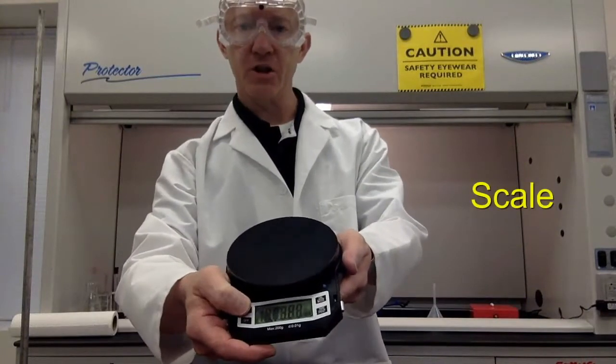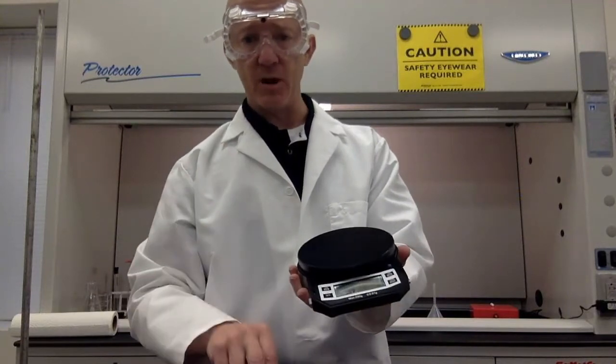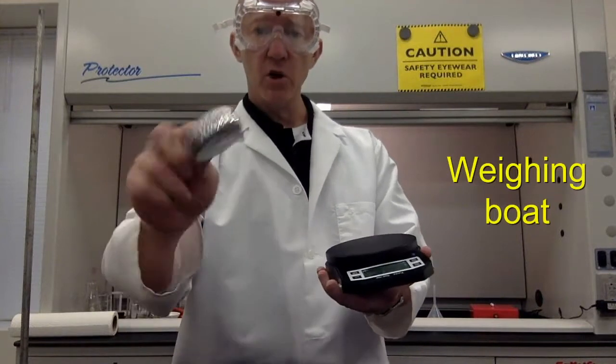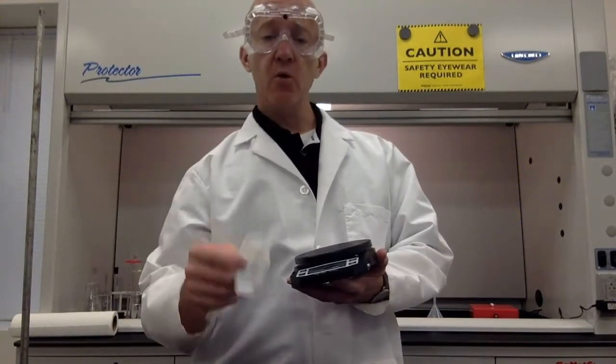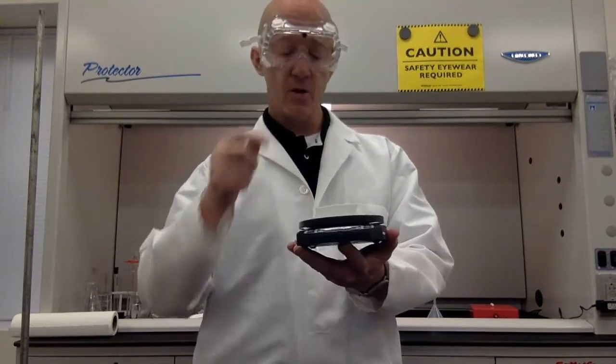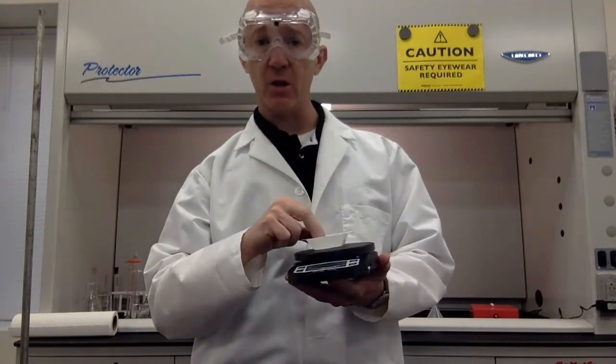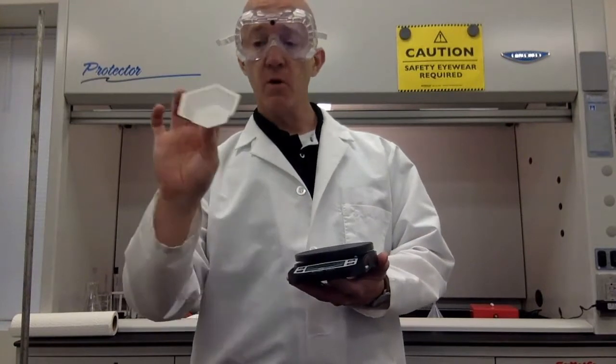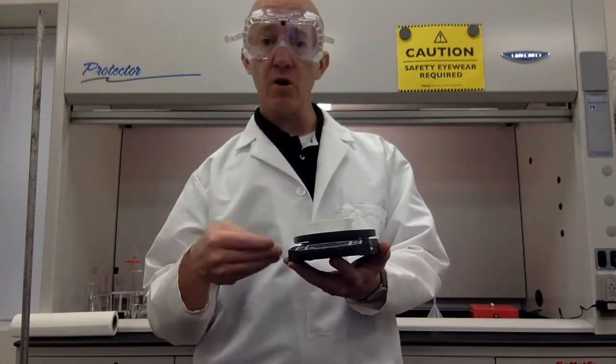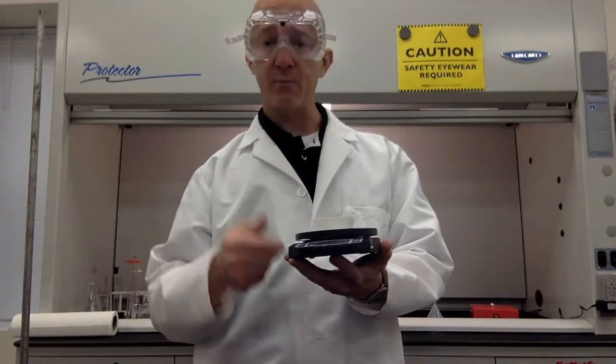Here's a balance or scale. We obviously use this for masses. We don't want to dump solids onto the scale by themselves so we use one of these. A weighing boat. You might see them in plastic or aluminum like this. If we use the weighing boat we can use it one of two ways. First we can take the mass of the weighing boat by itself. And then once we put the solid in we can subtract the mass of the weighing boat knowing how much solid we have. Or we can place the weighing boat on the scale and use the tare button. That will cause the scale to zero out. And then whatever solid you put into the weighing boat you'll have the proper mass.